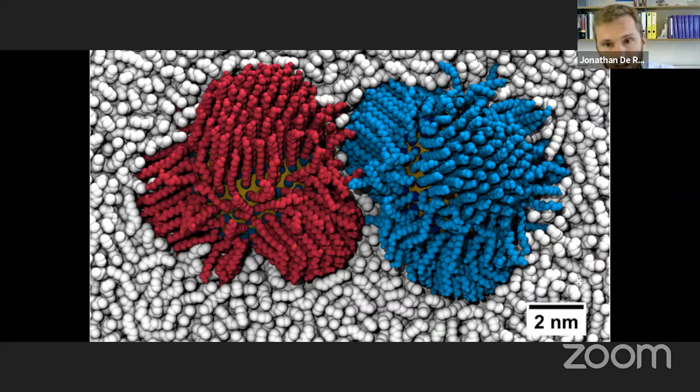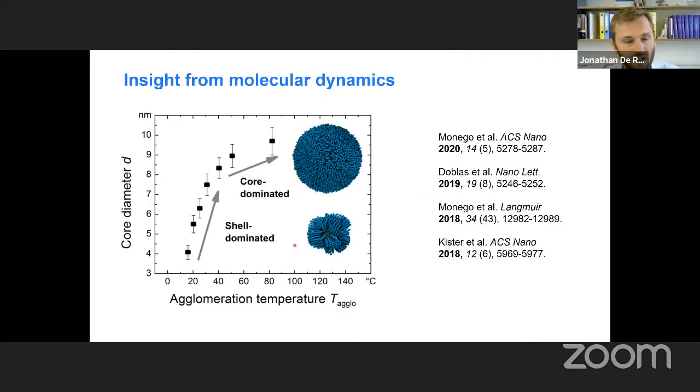And this was a very interesting contribution, because they exactly gave the point where nanocrystals behave like small molecules with an equilibrium solubility, and where the crystallization of the ligands determines the solubility.